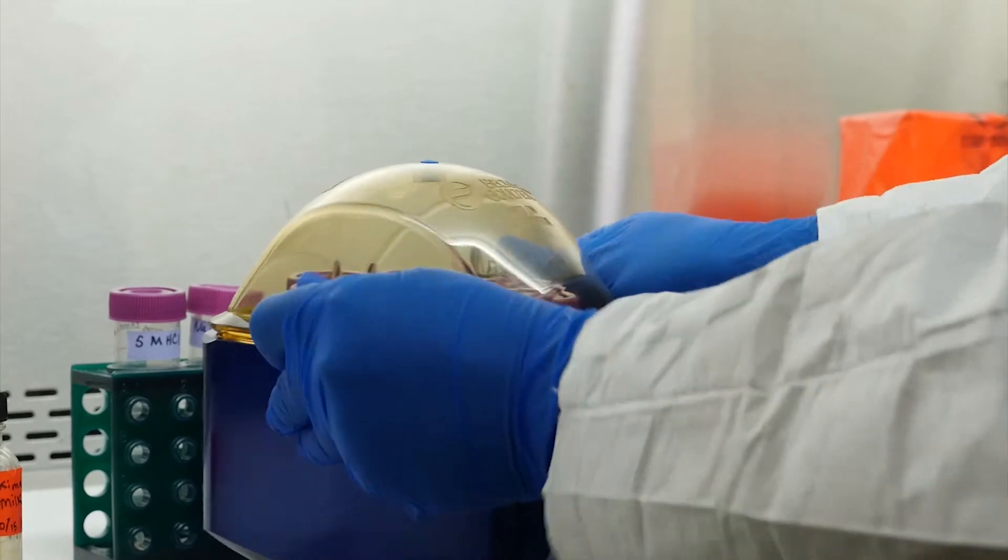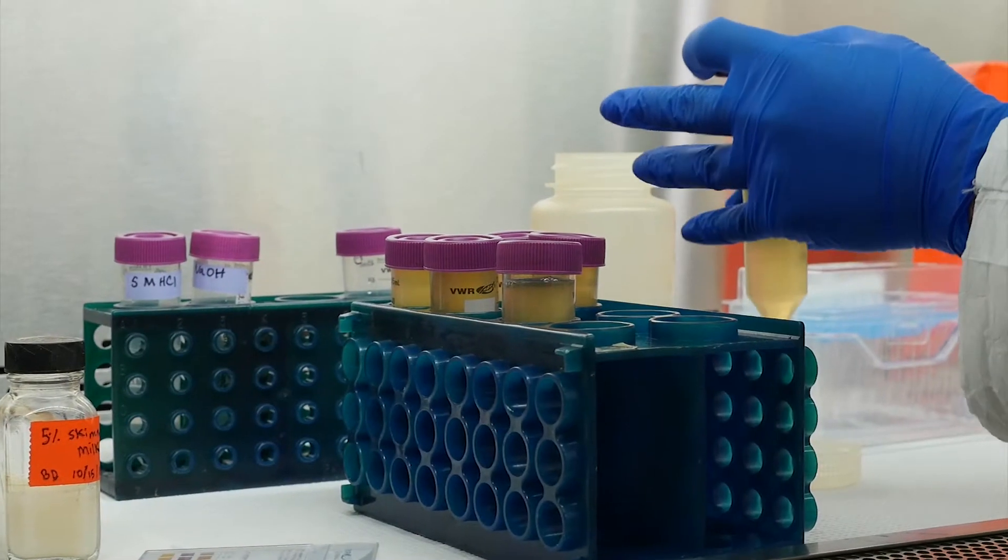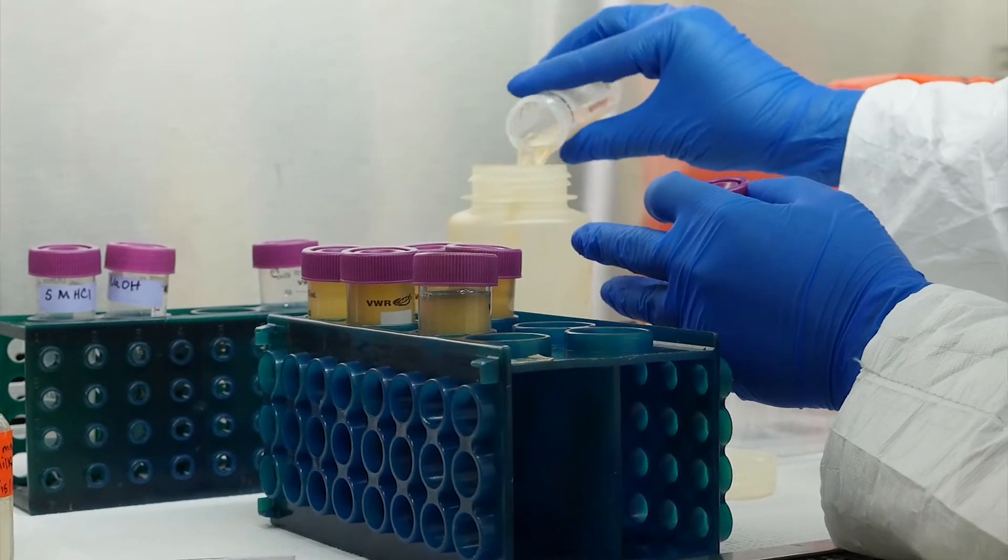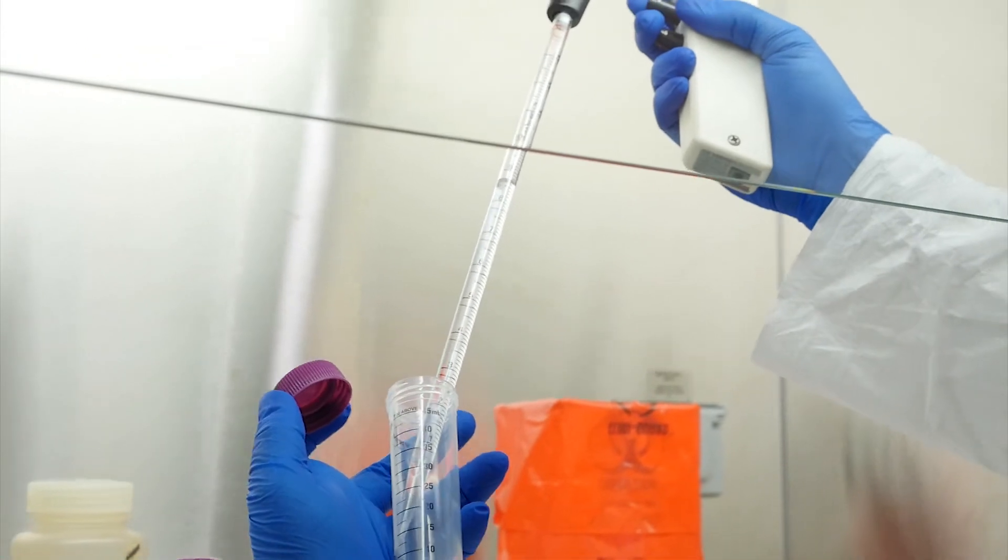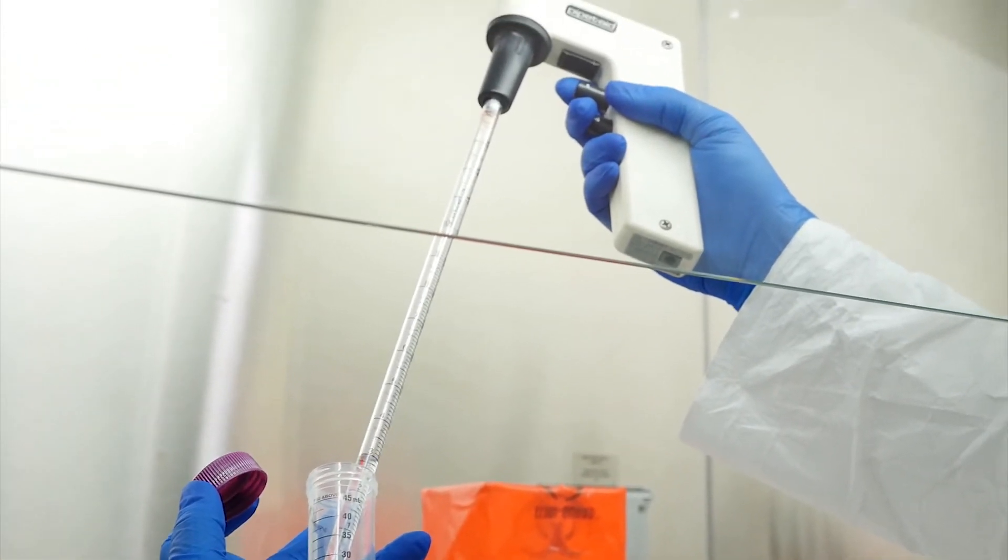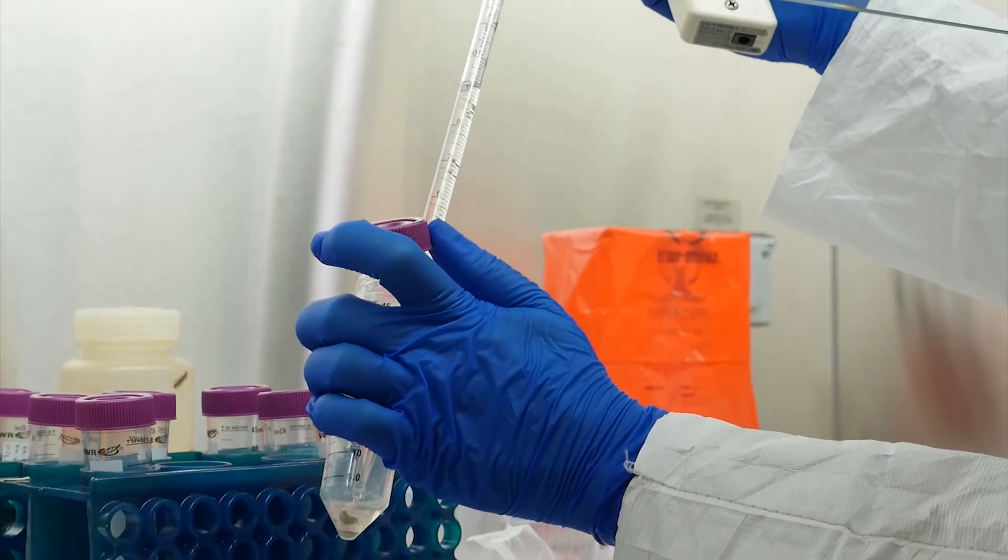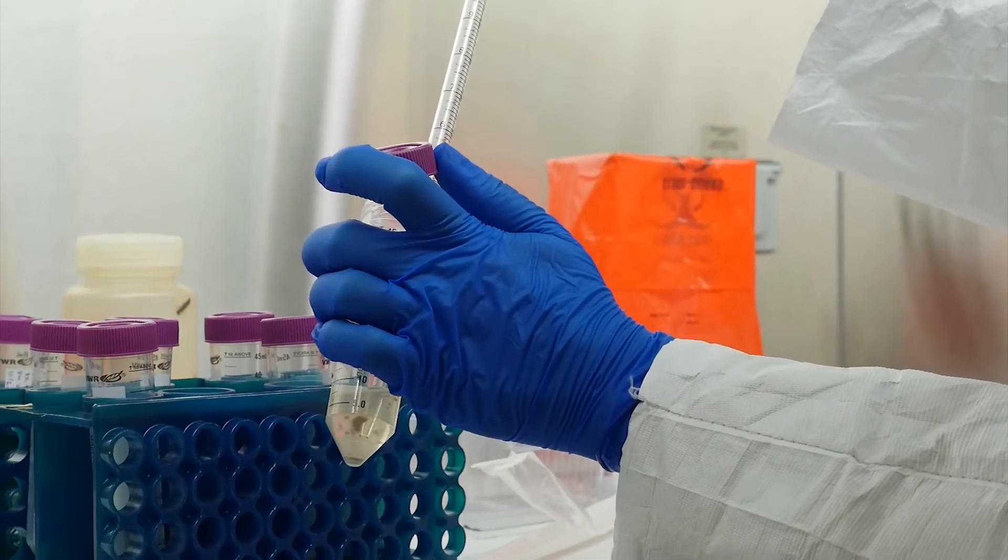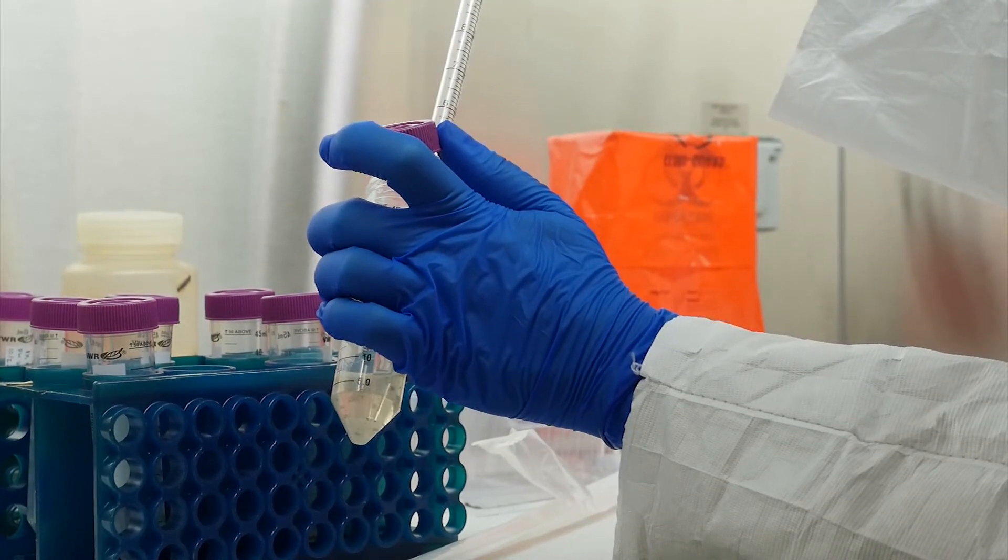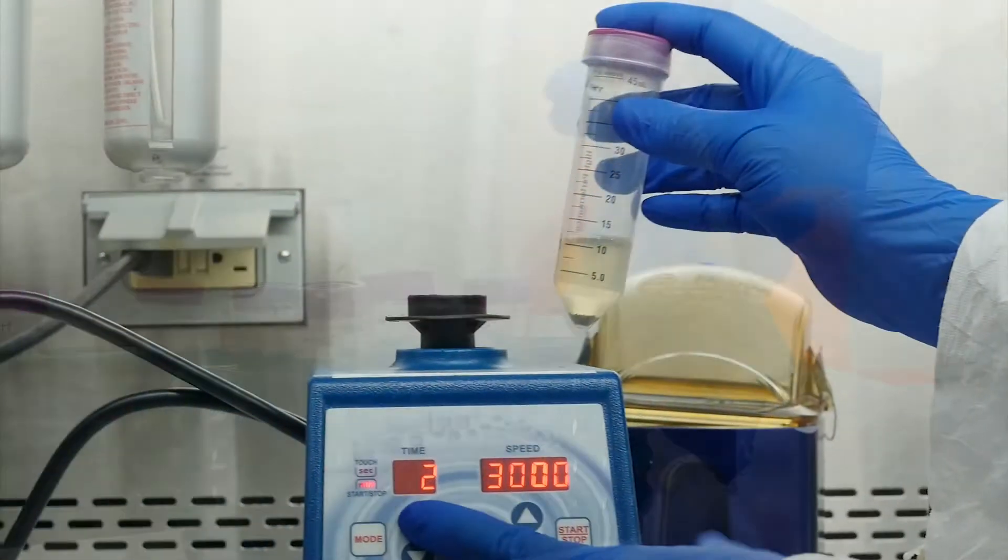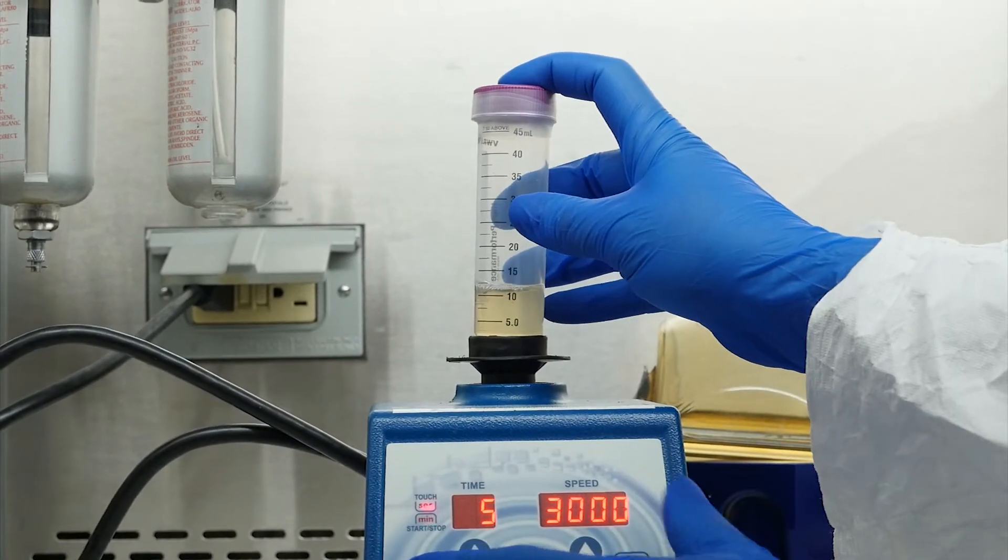After centrifugation is complete, return the sample to the biosafety cabinet. Discard the supernatant into the original sample bottle. Add 10 milliliters of sterile phosphate buffered saline to the pellet. If your sample is divided into multiple conicals, transfer the pellet between conicals so that all the pellets are resuspended into the same 10 milliliter volume. Parafilm the sample and vortex 5 to 10 minutes at maximum speed to completely resuspend the pellet.